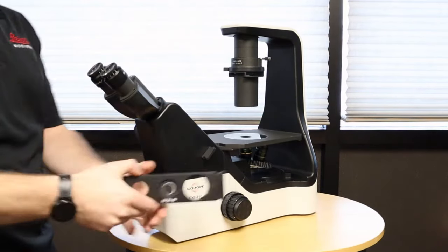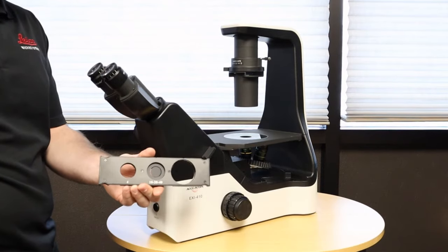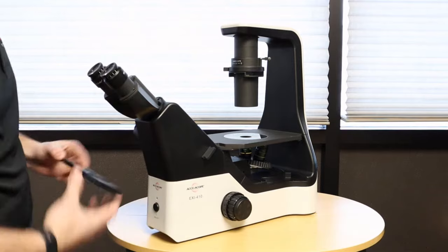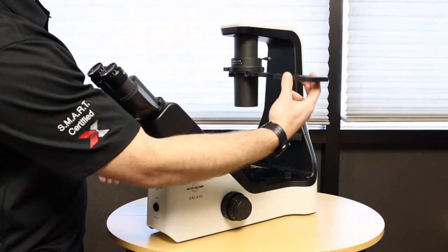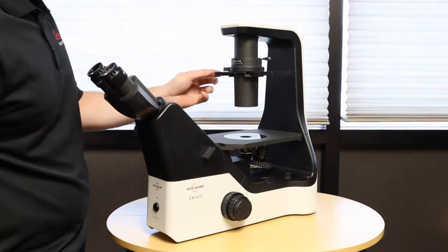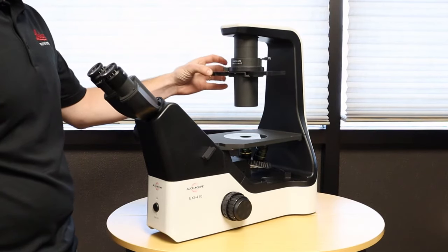And the last component is our phase slider. The phase slider is used to achieve phase contrast with the objectives and this simply gets inserted into the condenser slot. It can go in from either way, it doesn't matter. And there are click stops to help guide you across each position.